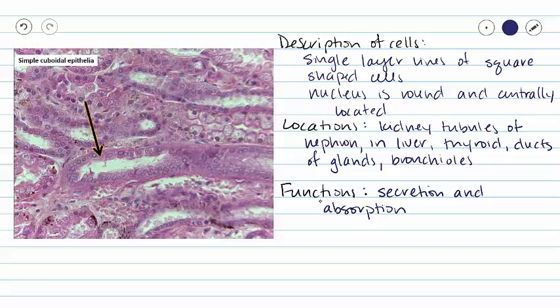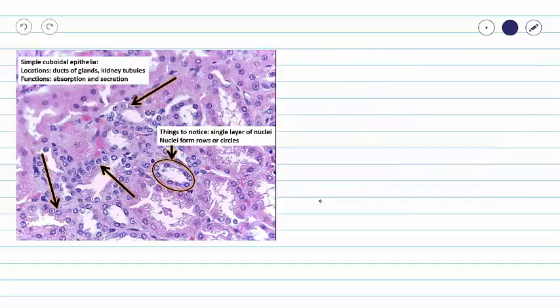So this slide is a little bit messy. Let's look at a neater slide than what we have here. Alright, in this slide we can see a little bit more clearly our very round nuclei. And I'm going to point out to you some of our square shaped cells.